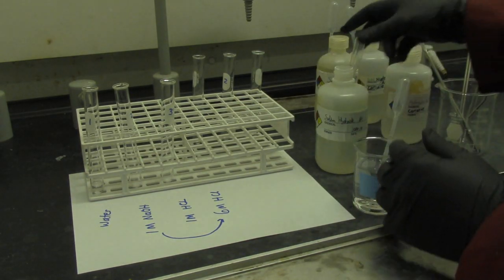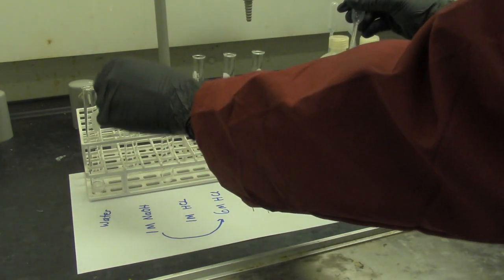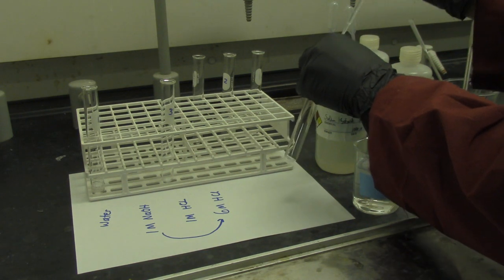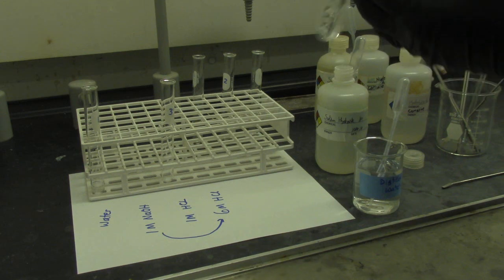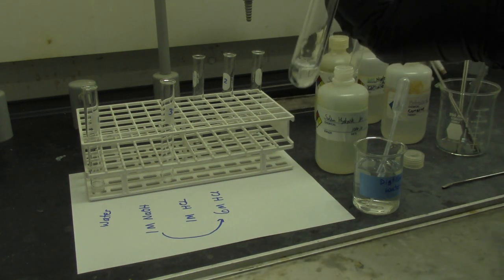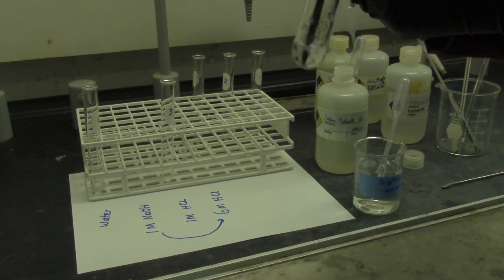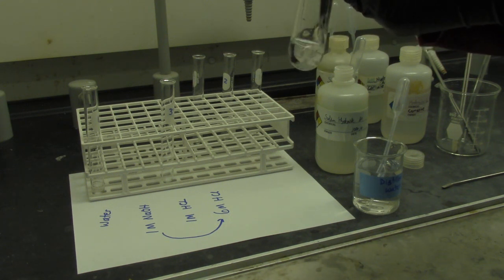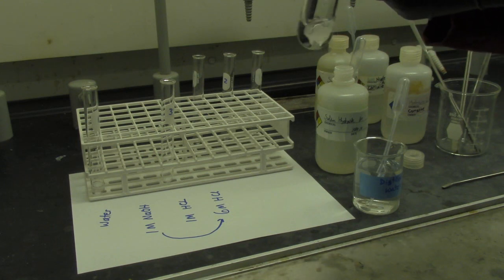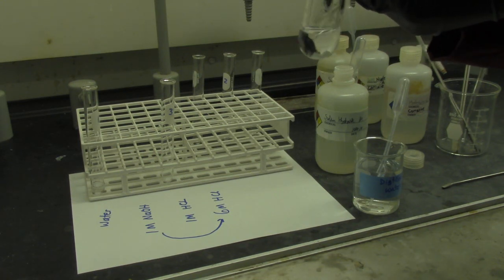To the second test tube, I add 1 ml of sodium hydroxide. Stir for 20 to 30 seconds. You see some solid at the bottom.